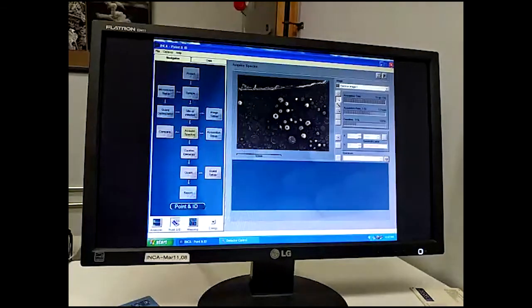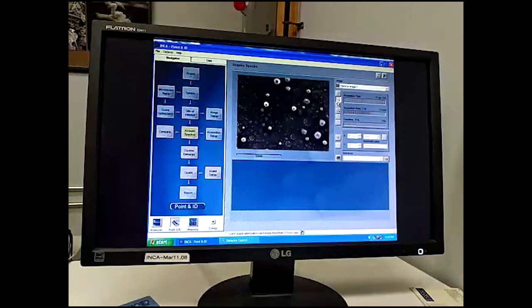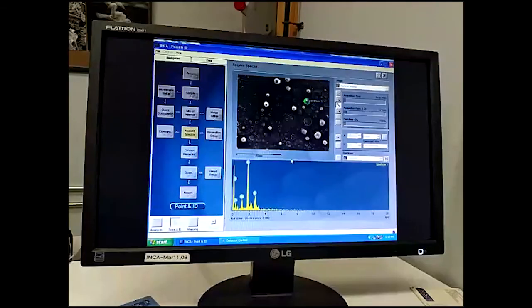Next, we go to Acquire Spectra. There's a variety of different tools. We have a point tool, we have a square we can draw, we have a magic wand tool that could recognize a full region. Try that out and give you a quick demo of that. So that one's getting the spectra from that whole area. Again, there will be a little bit of a delay while this starts up. And there you go, getting the spectrum from that particular spot.